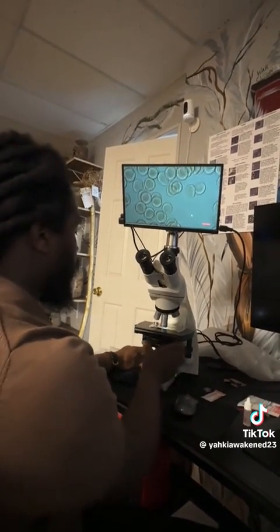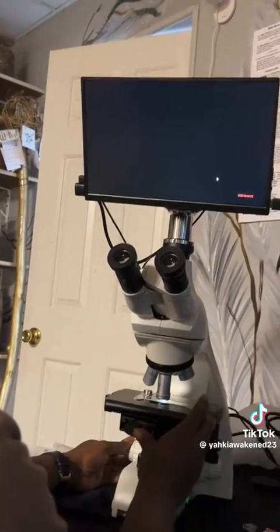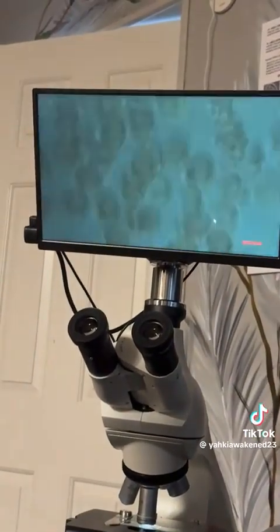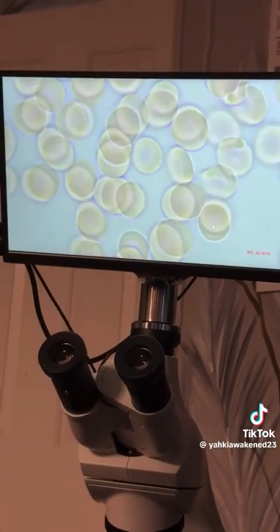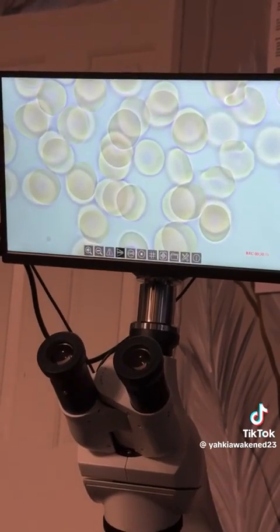So let's take it to another. Let's take it to Brightfield, because I see a lot of stuff under Brightfield as well. So I ain't never knocking Brightfield. Look, there go another one. You see them pleomorphizing, going through, and then you can see them in here mating too. They will actually mate in front of your eyes.